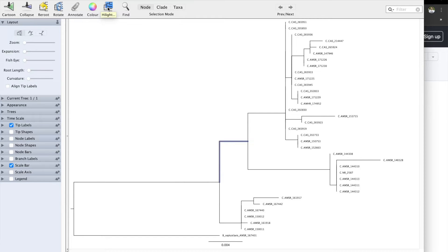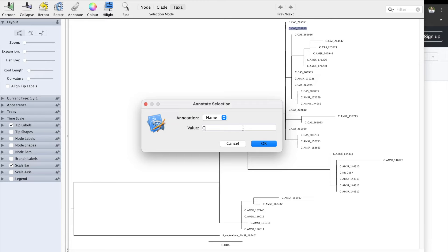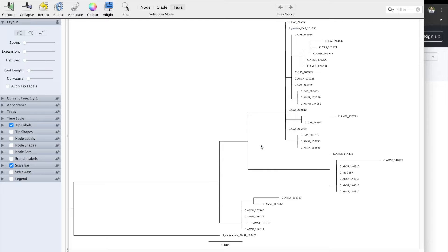Coloring and highlighting — you can use those, but I will show you another method which is going to make things a lot easier. Annotate is something we're going to use as well. To use Annotate, click on Taxa, click on one of the names you want to change. Click on Annotate, and I'm going to type in Bavai Gaitena CAS205850, which is the full name. Now it already looks a lot better, and you can keep doing this.